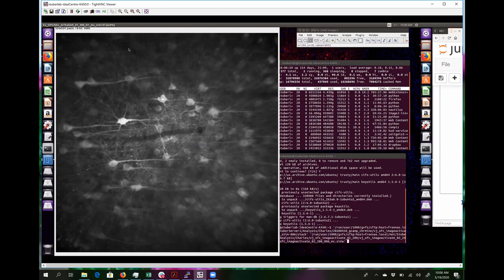Yeah. Just a point to be made here. All of these blood vessels and just how they appear, it's really helpful to have them in your field of view, because you can actually come back to the exact same field of view using those as a landmark. Right, yeah, I've done that before. When you get good at this, you'll be able to quickly get to these just because of the blood vessels. And then sometimes the cells are a little bit harder to align off of just because not all of them are active all the time.